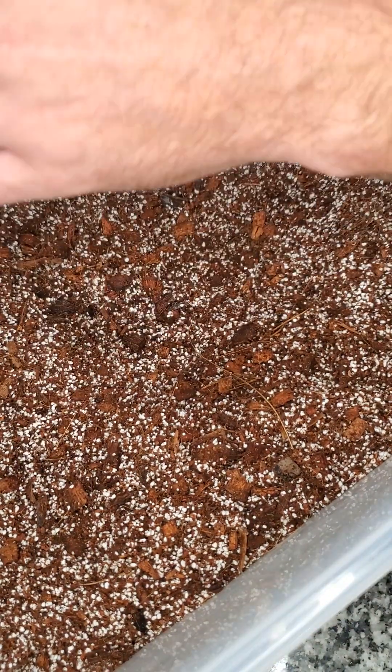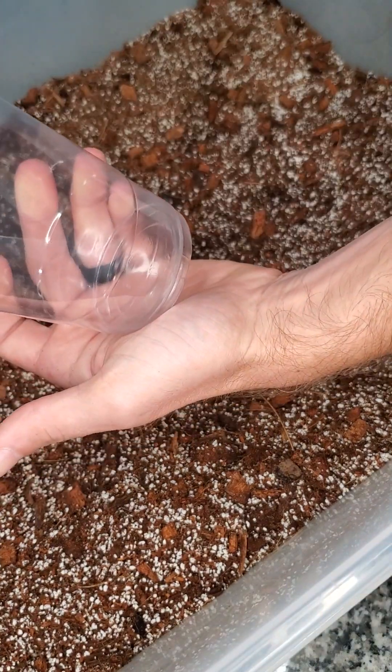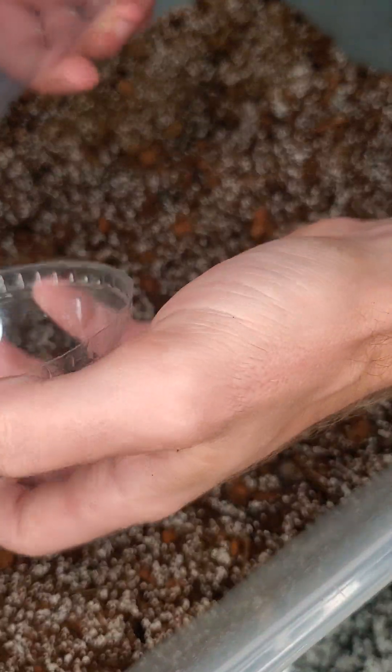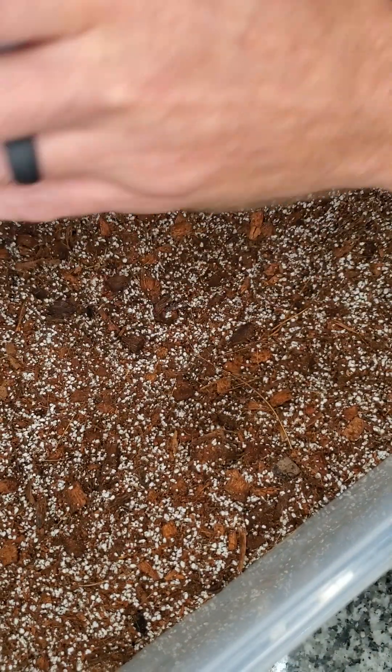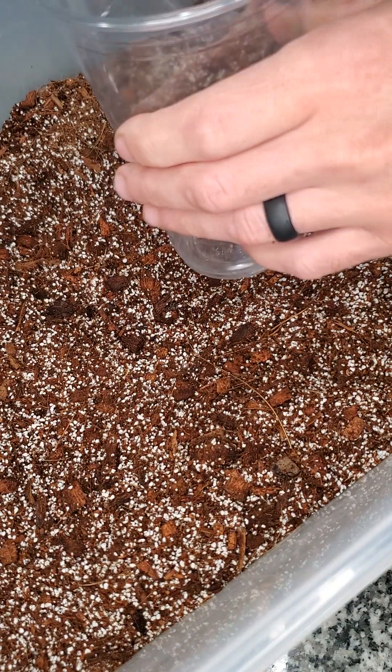On our website, available for purchase at orangeecknursery.com, we have these cups which are very simple — it's our acclimation kit. It's a standard clear cup with a dome, no holes, fully enclosed. They make this process very, very easy.